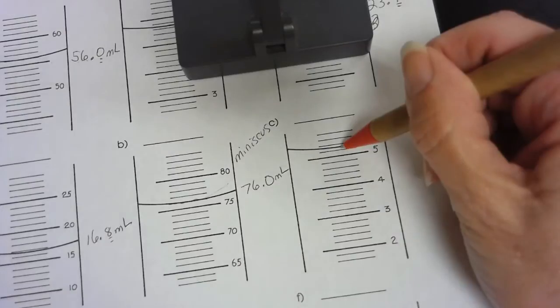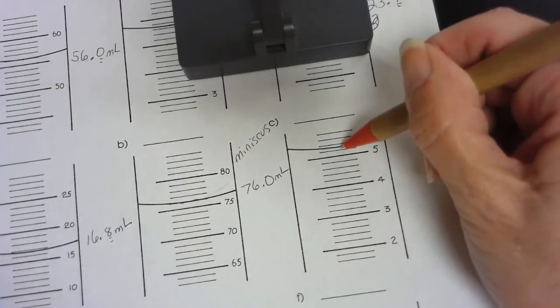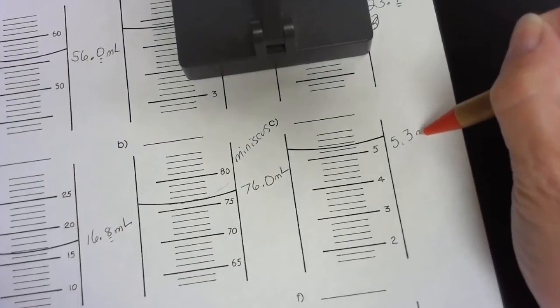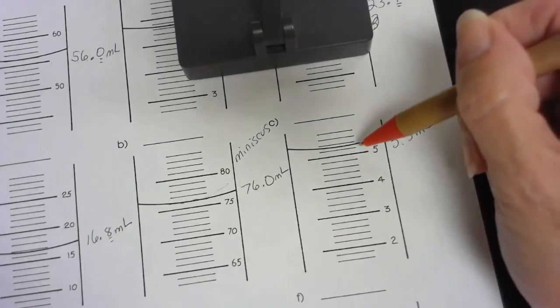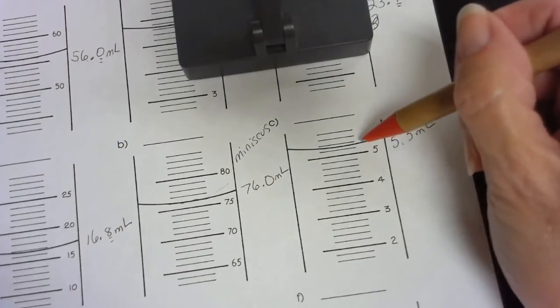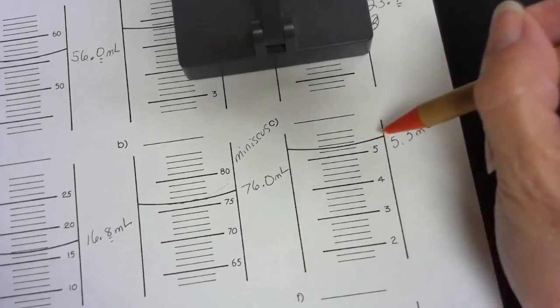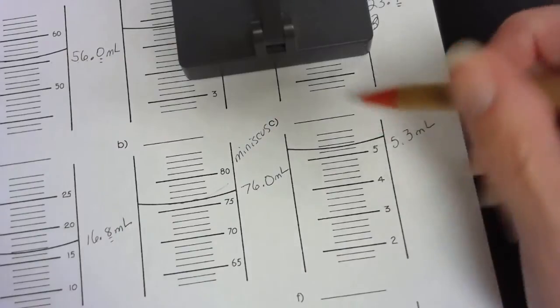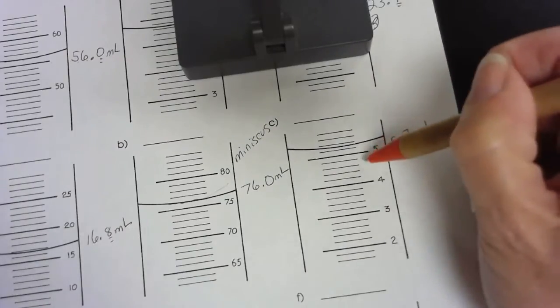We can just about estimate that that is going to be 5.3 milliliters.